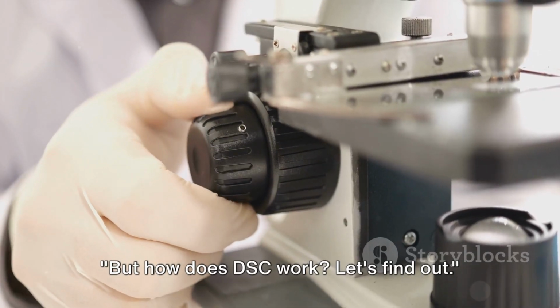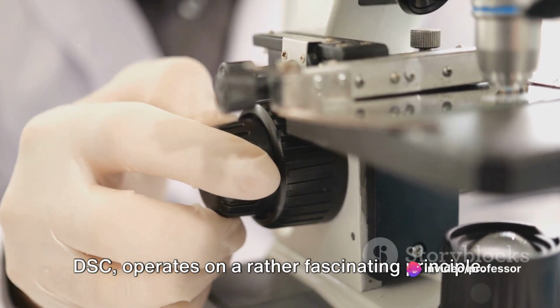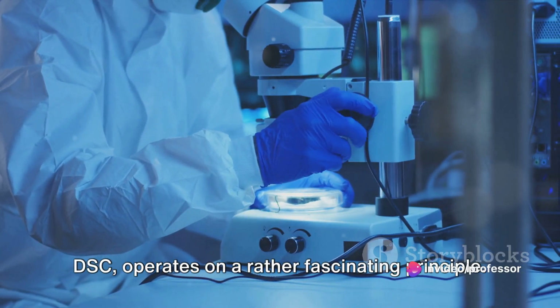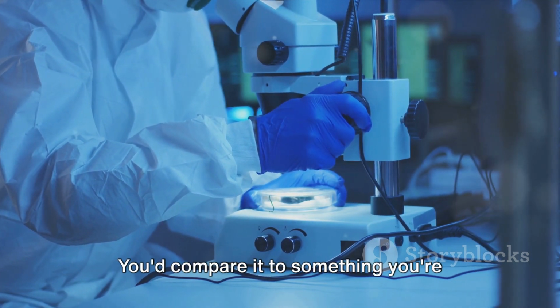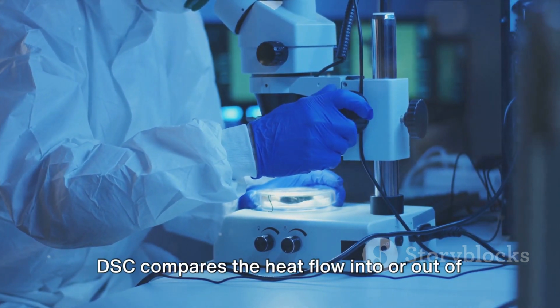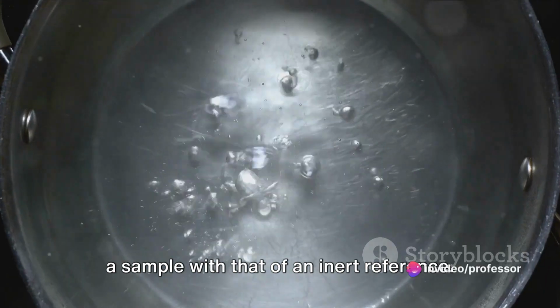But how does DSC work? Let's find out. Differential Scanning Calorimetry, or DSC, operates on a rather fascinating principle. Now, imagine you're trying to understand a new song. You compare it to something you're already familiar with, right? Similarly, DSC compares the heat flow into or out of a sample with that of an inert reference.